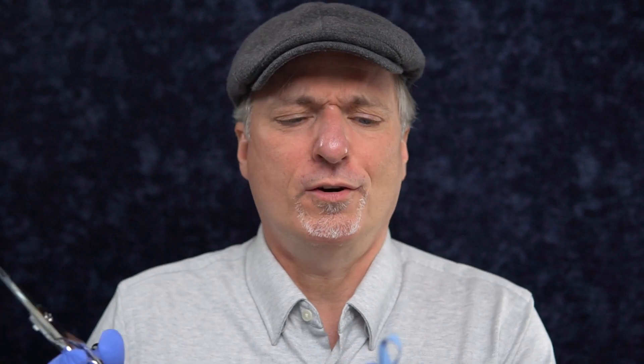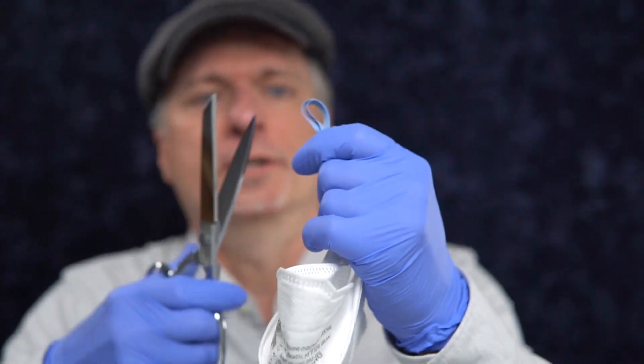So the score is gonna come down some, I think, when I cut this into headbands, and I'm just gonna do the field expedient version. I'm gonna take these two headbands and find the middles and just cut them in half. Kind of hurts doing this to a perfectly good mask, but let's go ahead and do it.